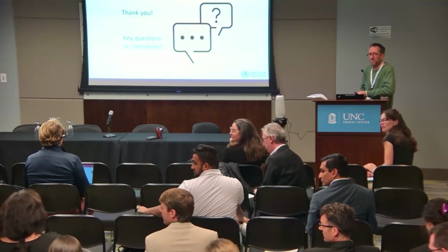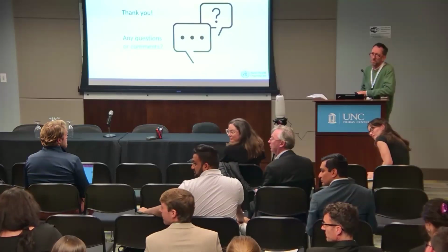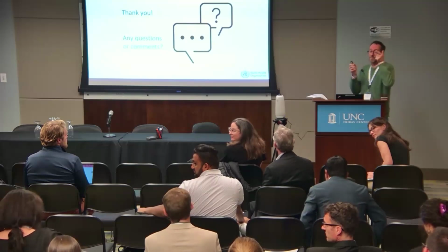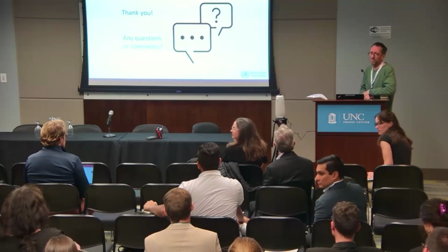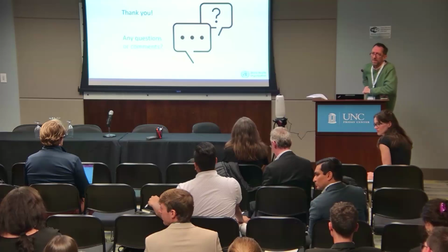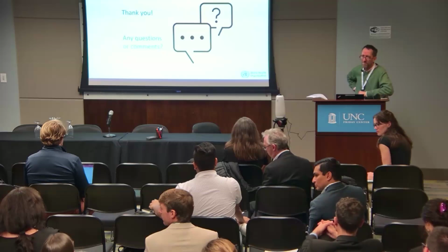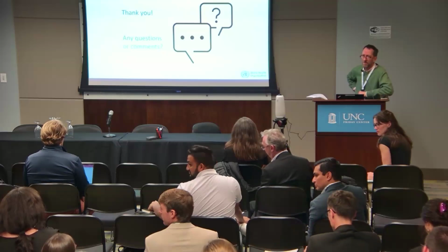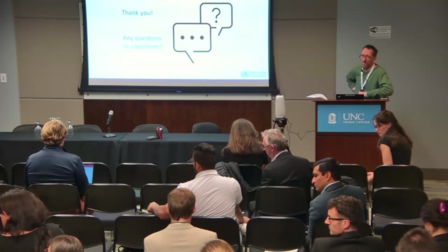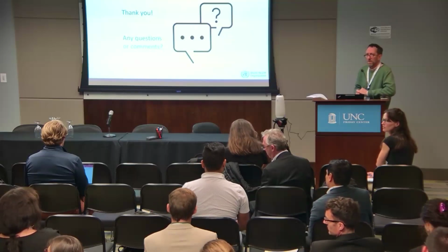for making these results available. I think it's very useful. If I'm not mistaken, UNICEF once also launched a challenge to develop more instant test kits. Because our challenge in the field is that we need 2 visits to confirm to a household that their water is dirty, and we're competing with TDS meters, which, like a pregnancy test or a COVID test, give some kind of result immediately. I know it's a bit beyond what you've been testing, but could you update us a bit on what your findings are with regard to those testing kits?